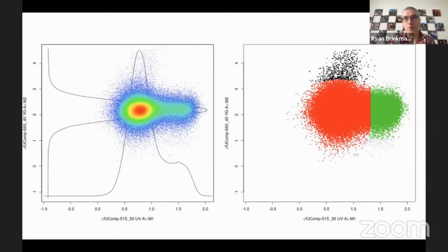Here's another thing. There's this little bleb coming up off of here. Is that part of this population? Maybe, maybe not. We say probably not. We can argue about this over beers later when I see you guys all again. I miss you all. But we train the players to split all these off and have these center clusters, and stuff that comes off to the side, we want those put into separate populations. And we're now rolling out visualization techniques to show them that, for example, this shoulder is somewhere you might want to cut off from the main population.